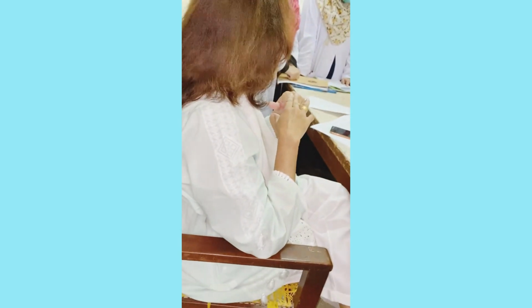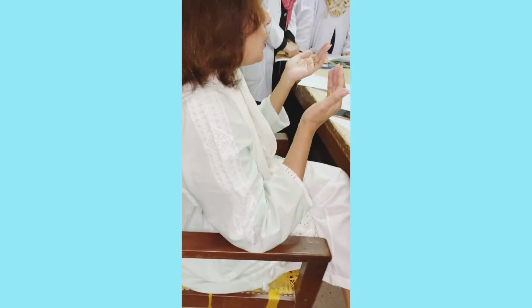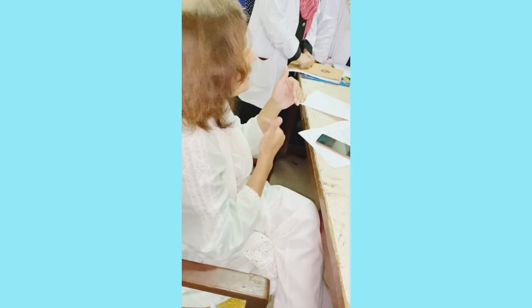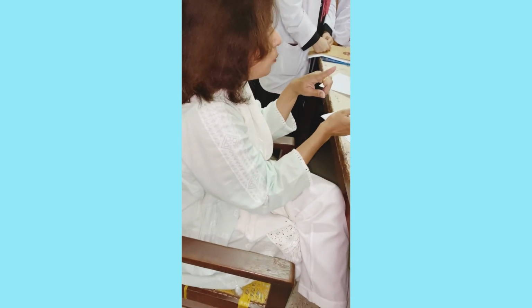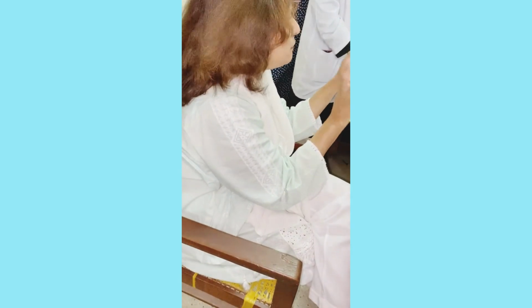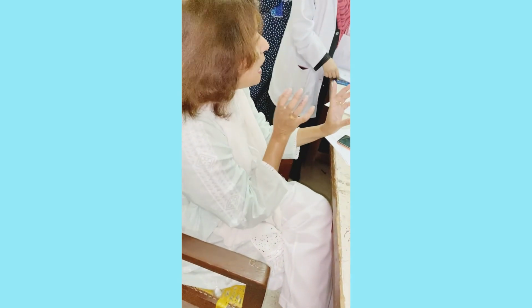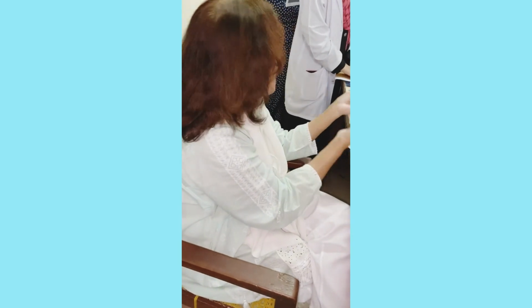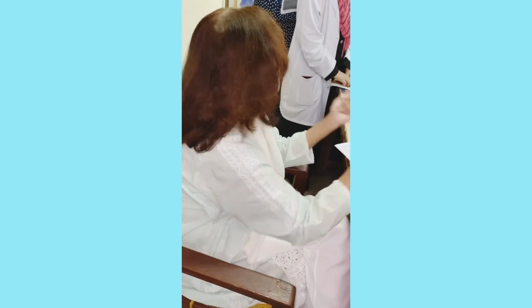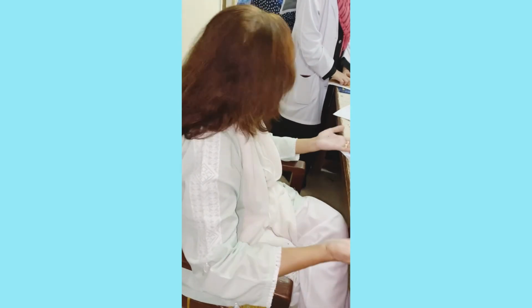Now, if you have anything in your mind, ask me. Glacial acetic acid is not a strong acid. It helps in getting your precipitate. It is used with the other acid, which is a strong one. So we made a combination of a strong acid, which provides strong protons, and a weak acid, which will also help in the progression of the reaction and in providing you this product which you are looking for, which is P.Nitro acetanilide.